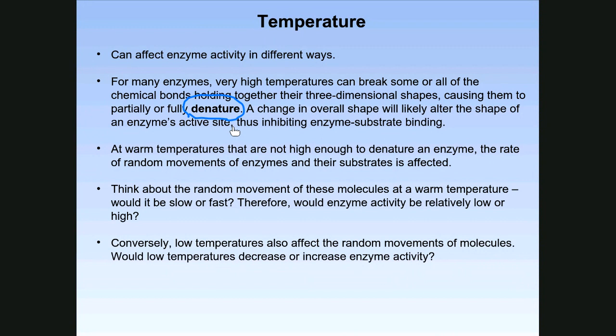How much product the enzyme is producing is measured actually every 15 seconds. So you'll see these absorbance values increasing. And I'll go over more what these absorbance values mean in a bit. Well, 65 degrees Celsius is a very high temp. And what's been found is that when enzymes are exposed to very high temperatures, they denature. Therefore, they lose their shape. They no longer function. So high temps inhibit enzymes by inactivating the enzymes. Enzymes are no longer active.